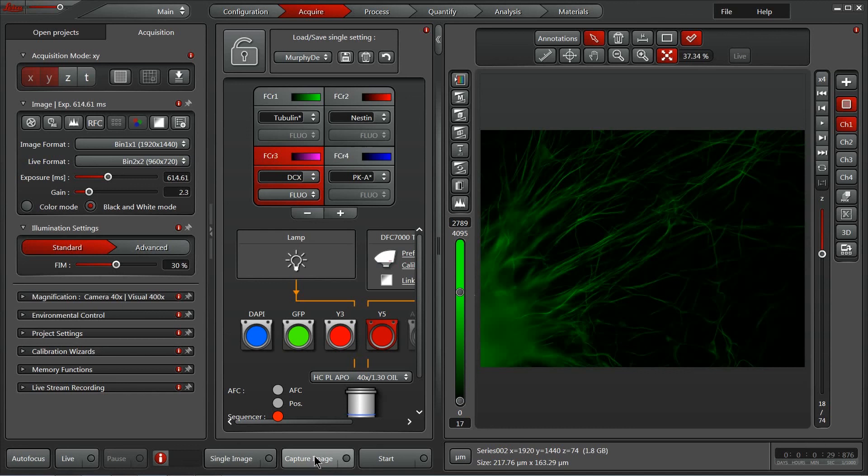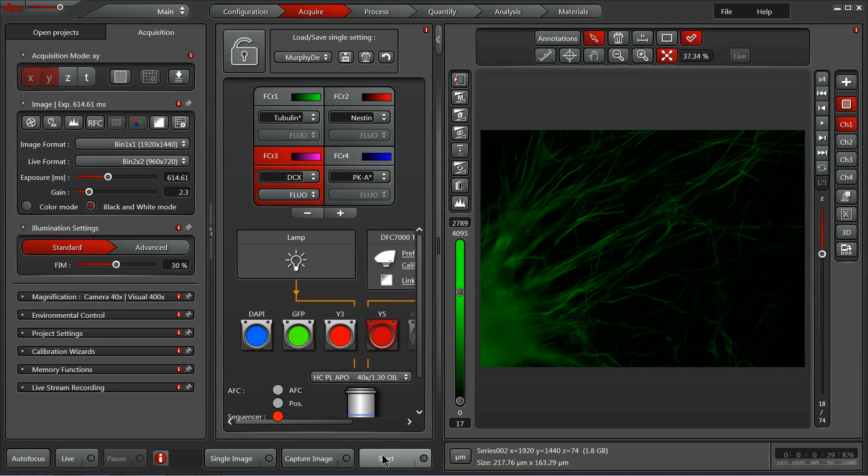Capture image will capture all of the channels, but again, it will ignore the additional dimension information you've got laid out in your experiment parameters. And also the start button, which will actually begin all channels, all dimensions for your experiment.